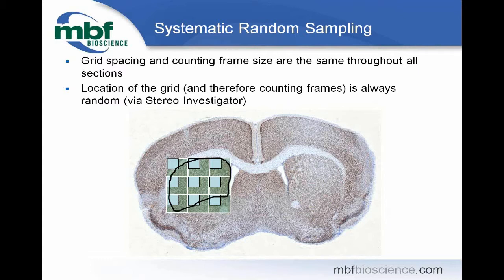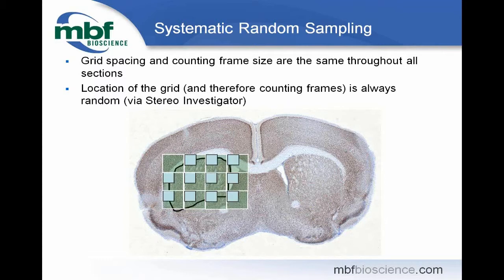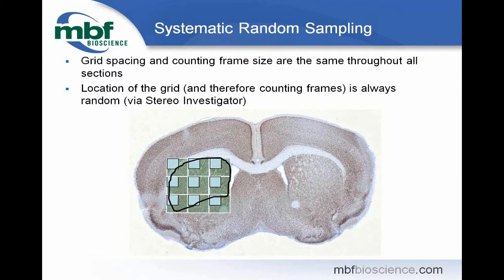The SRS distribution of sampling locations will be varied from one acquisition run to another, as the software decides where to place these sites. Acquiring an SRS image stack means that image stacks will be acquired from random locations, but their position relative to each other will always be determined by the user.